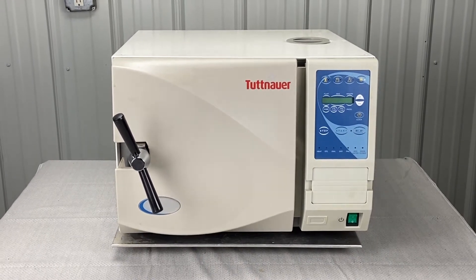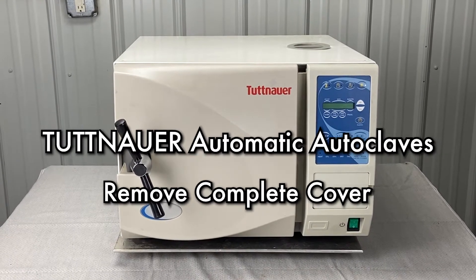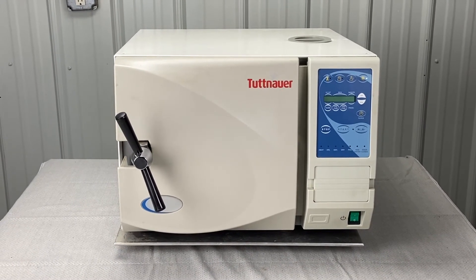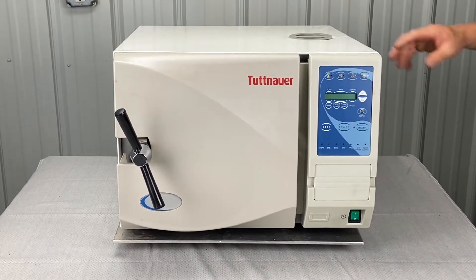Right now I'm going to show you how to take the cover off a Tuttnauer EZ9. It's very similar — all the automatic units are pretty much the same, whether it's a 2540E, an EZ10, or an EZ10K. They're basically all the same.